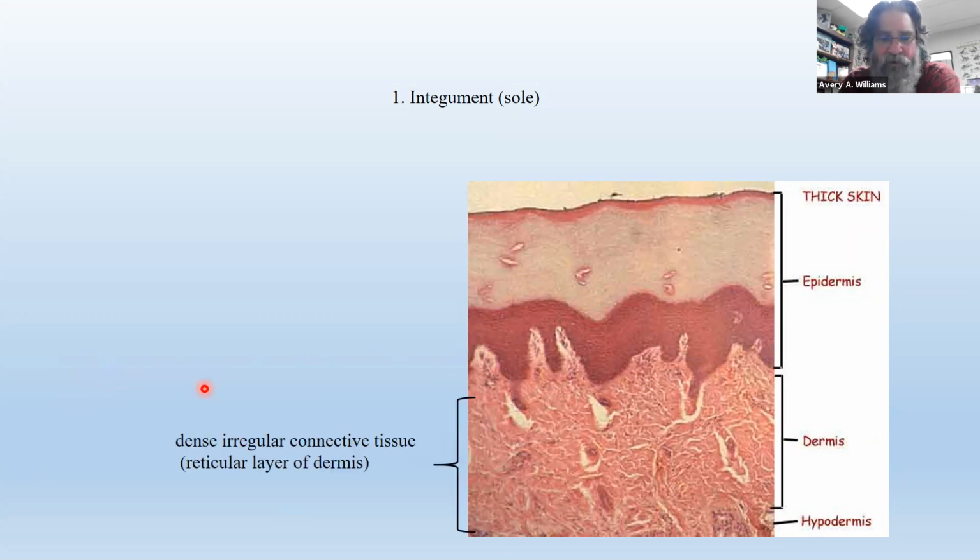You got that? Now, what about all this stuff down here? If you look at this, it looks like the same thing as this, but it just has more reddish fibers in it. Well, that's exactly what it is. To tell you the truth, there's really no difference between areolar connective tissue and dense irregular connective tissue other than the proportion of collagen fibers in the matrix. And the collagen fibers are what give it its color. See, it kind of looks like shredded wheat. See these little reddish bands going every which way. It doesn't look like it's arranged in any particular pattern. It's all just kind of random. So you got these random little collagen fibers just wadded up in there every which way. That's what makes it irregular.